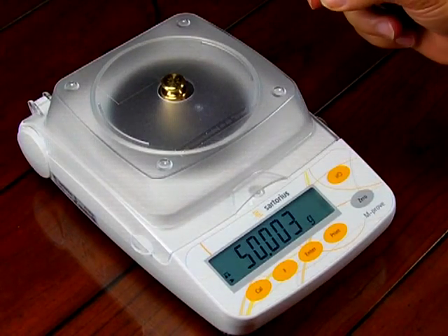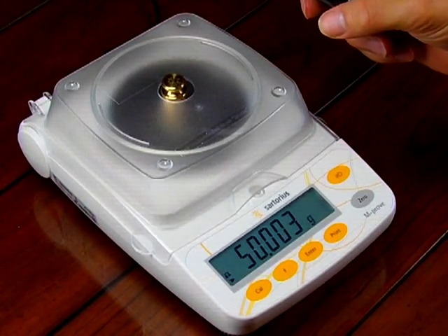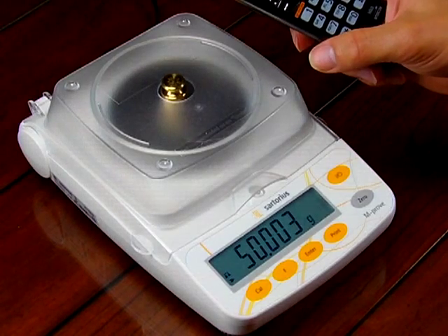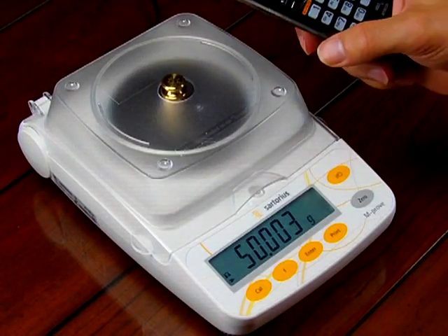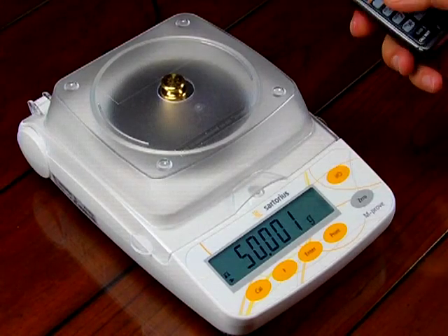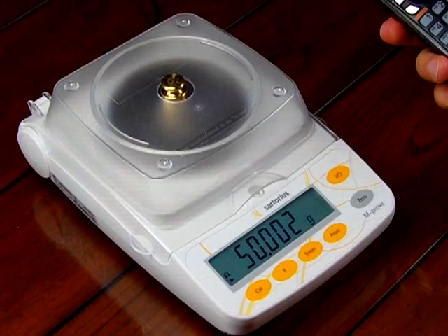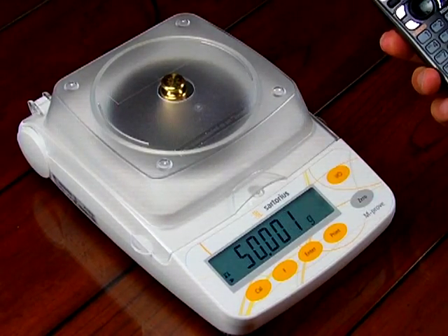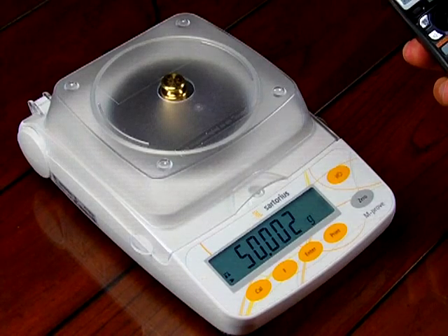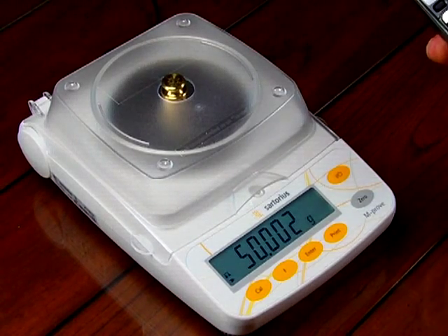So again, if you are using any kind of digital scale, you really want to watch your electronic devices. Even an old CRT tube can really have a strong effect, as can a cell phone or a handheld phone. You want to make sure that you don't have these devices on when you're using your digital scale if you want accurate readings. We hope this demonstration shows you what radio interference or signals can do to affect the balance. If you have any questions, visit our website — balances.com or scaleman.com. The company is Precision Weighing Balances. We're an authorized Sartorius distributor and we've been in business since 1995. Thanks for your time, and we hope this video was extremely informative.